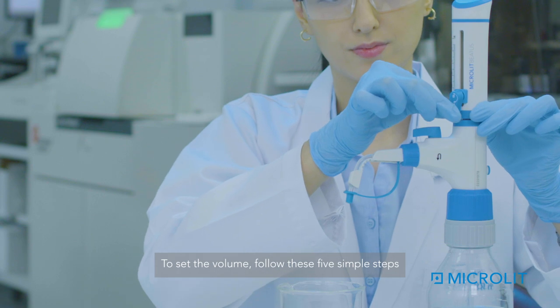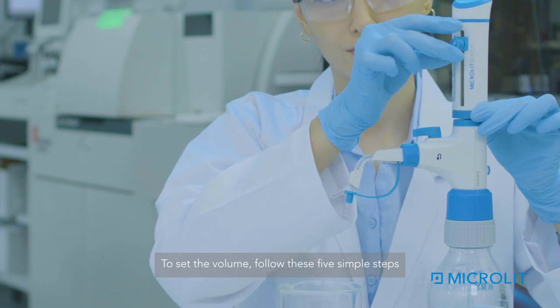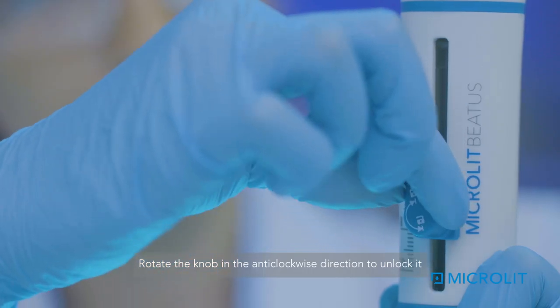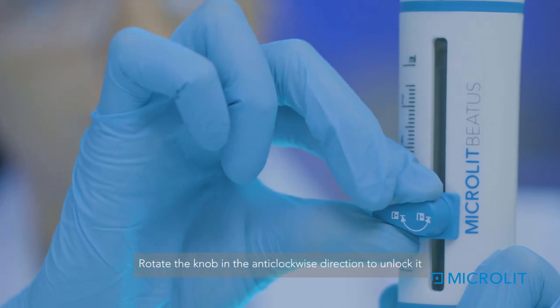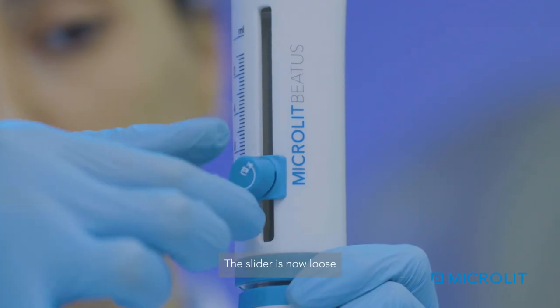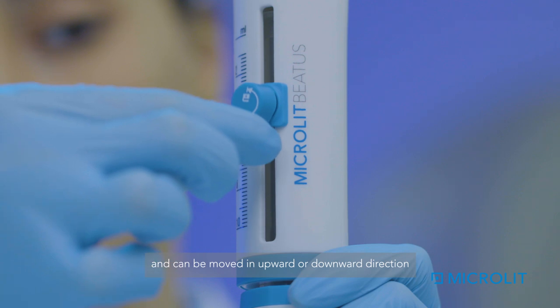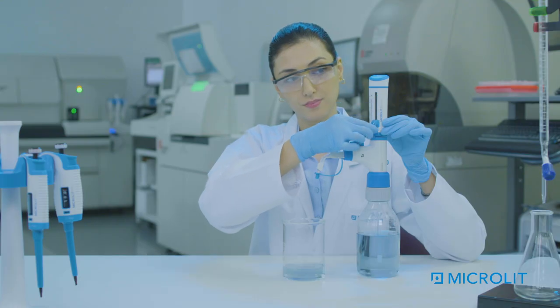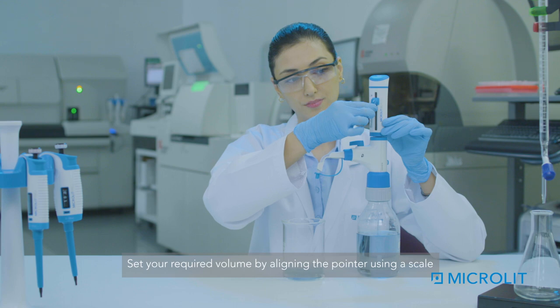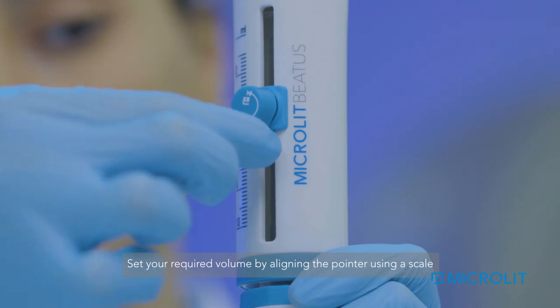To set the volume, follow these five simple steps. Rotate the knob in an anti-clockwise direction to unlock it. The slider is now loose and can be moved in an upward or downward direction. Set your required volume by aligning the pointer using a scale.